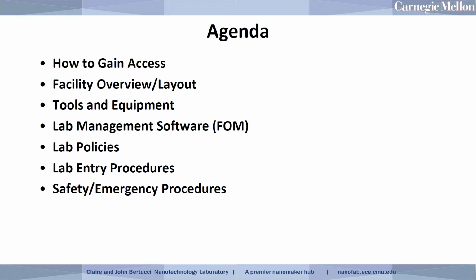We'll review some lab policies that we've put in place for all users, and we'll summarize the lab entry procedures that we use to enter the lab. Finally, we'll wrap up by reviewing the necessary safety and emergency protocols that we have in place for the lab.